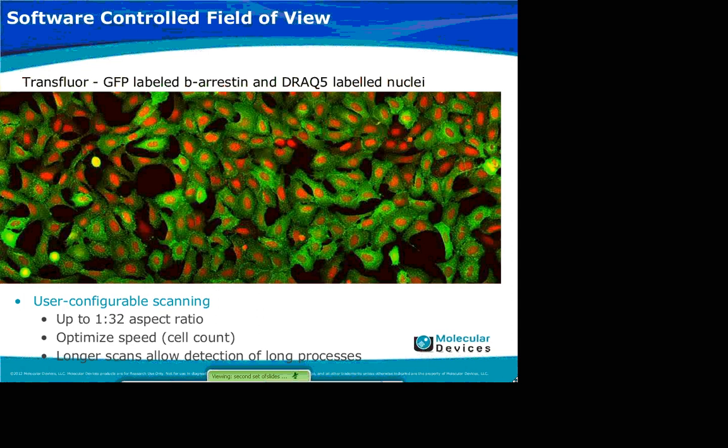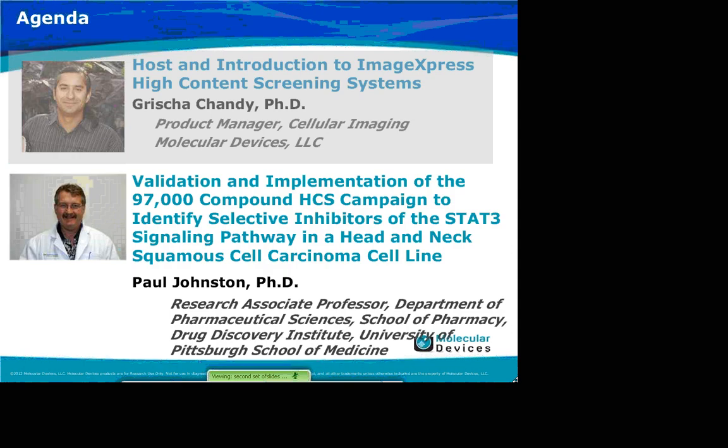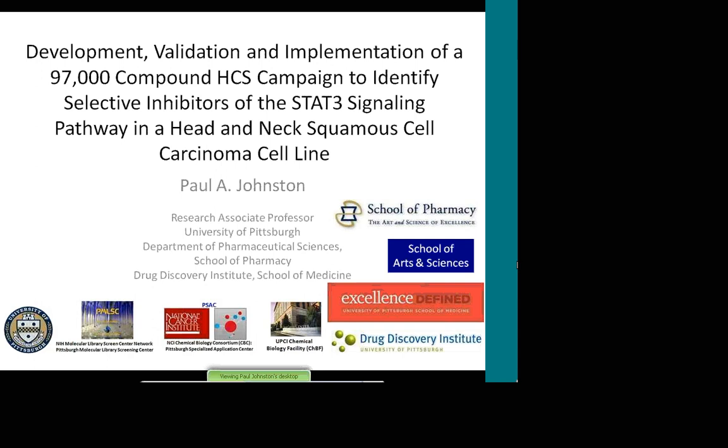So that's just a short introduction, and now I'd like to pass the presenter ball over to Paul to talk about his STAT3 screen. And I'm going to be talking about a 97,000 compound high content screening campaign, where our goal was to identify selective inhibitors of the STAT3 signaling pathway in a head and neck squamous cell carcinoma cell line.